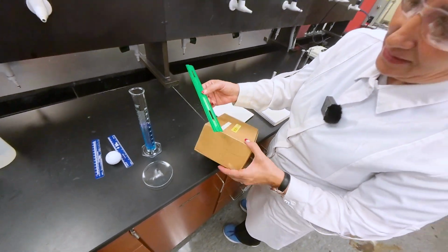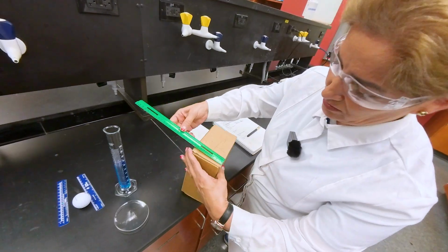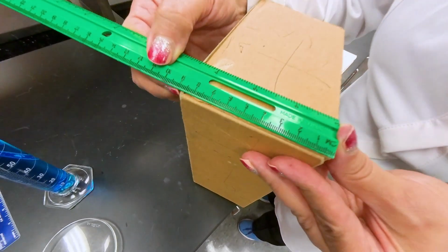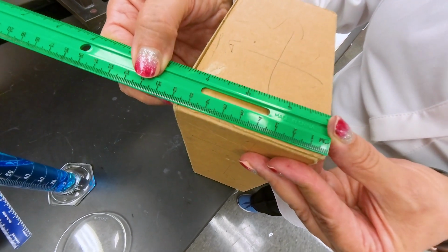14.5 something, and that's something you would estimate. I also need the height. For the height of the box, I measure this again as the number.